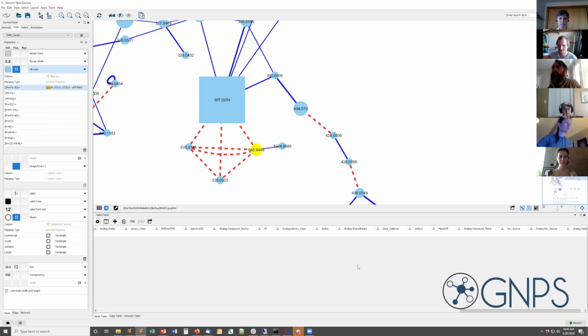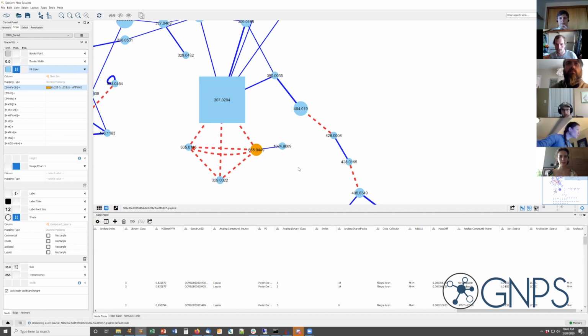Hey Daniel, in these approaches, when we're changing edges or fill colors and we're searching for iron, there's maybe 20 different selections to go from. Is there a way where you can just say do all of them that include iron, instead of one by one? Like looking at your screen right now, there's 2M plus iron, another one down there, and you do this all individually to color them individually.